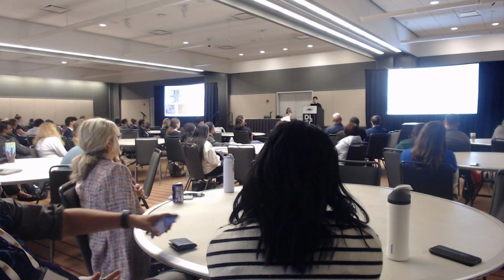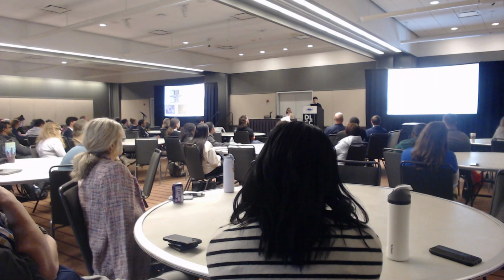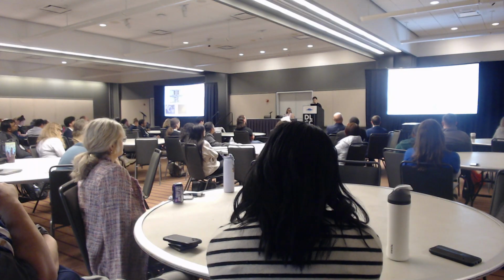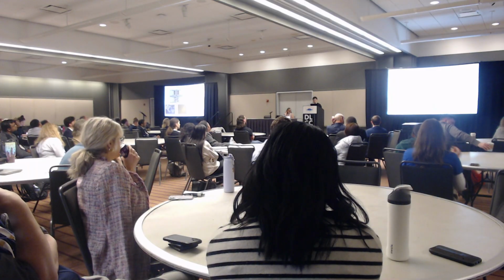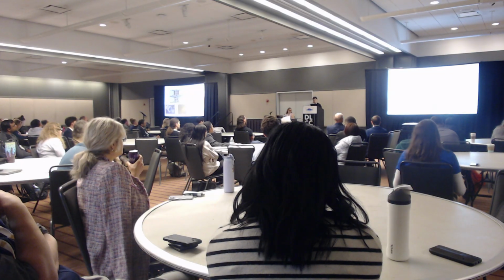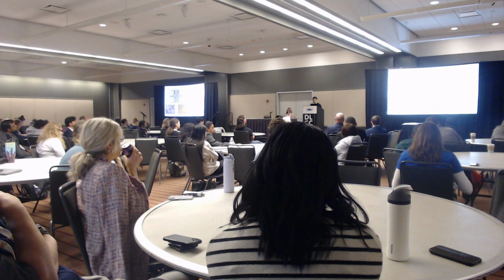To deliver the spatial barcodes into the tissue, we designed these microfluidic devices. We have two sets of microfluidic devices. One flows horizontally, the other one flows vertically. So here is a real picture of the device. We have, for example, 50 inlets and 50 outlets. We add the spatial barcode solution to each inlet and then use vacuum to introduce the spatial barcodes on top of the tissue section to deliver the spatial barcodes into the tissue.